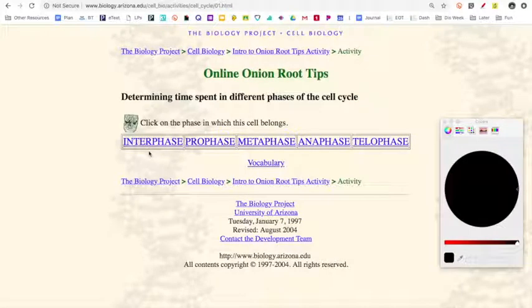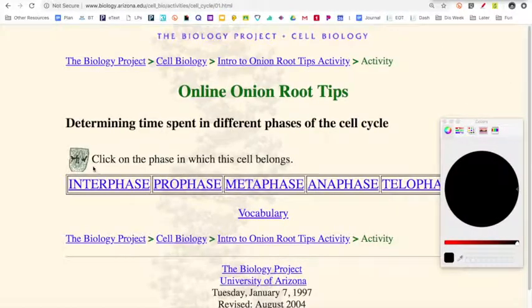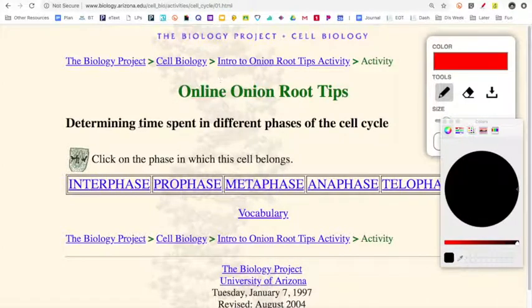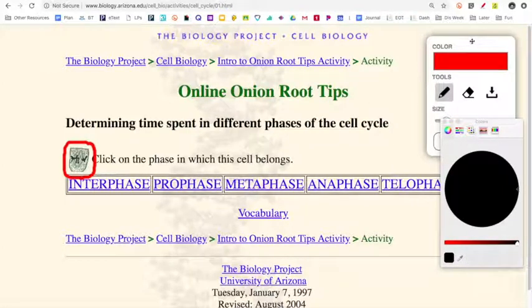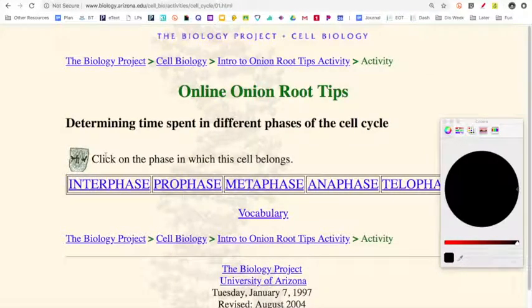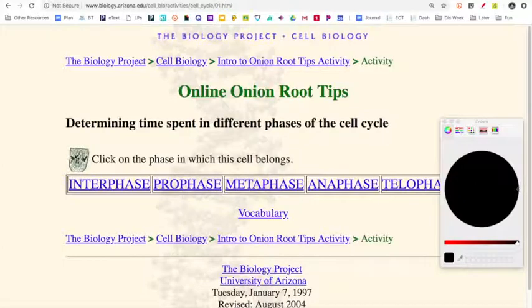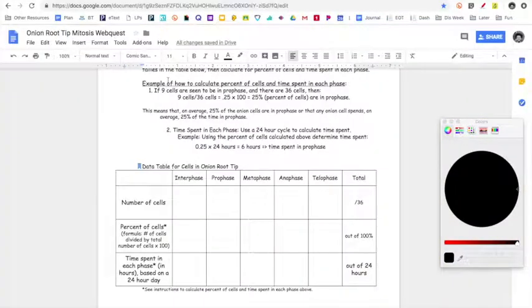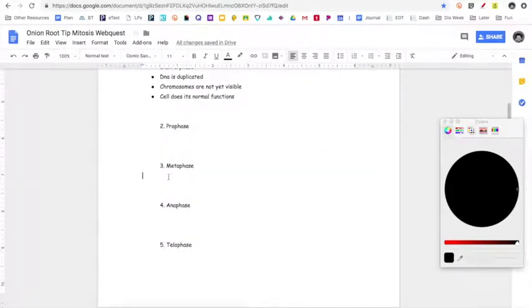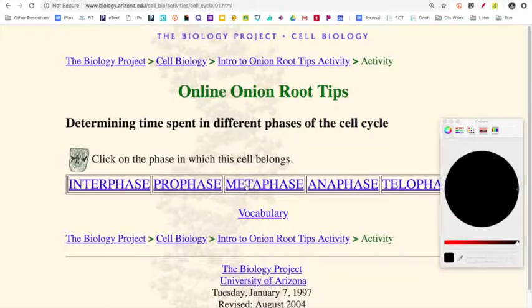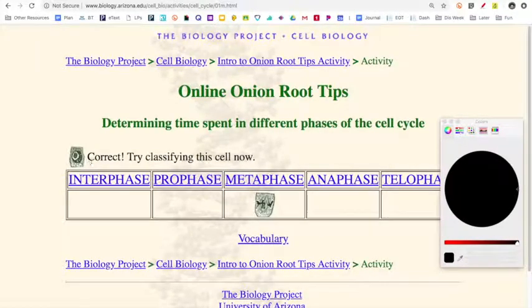When you click next, it's going to show you a cell — this tiny little cell right here. I'm going to go ahead and put a circle around it so that you can see it. What this is asking us to do is figure out which phase this cell is in. These black lines here are our chromosomes. We want to think: are my chromosomes in the nucleus? Are they being pulled apart? Or are they in the middle of the cell? Hopefully we can see that these chromosomes are in the middle of the cell, which means the cell is in metaphase. So you're going to go ahead and click metaphase, and that will put the cell into the metaphase bucket.